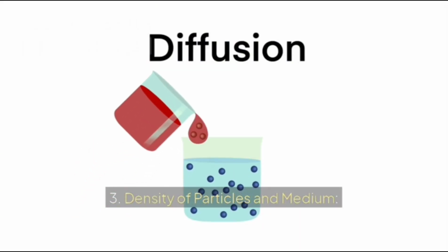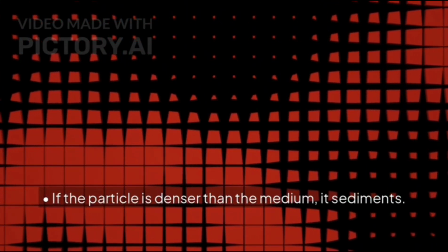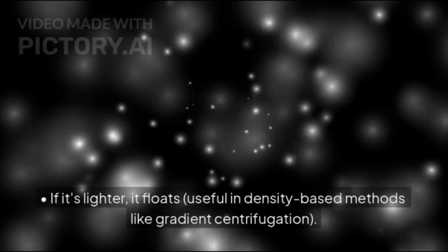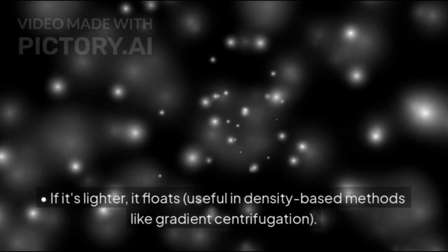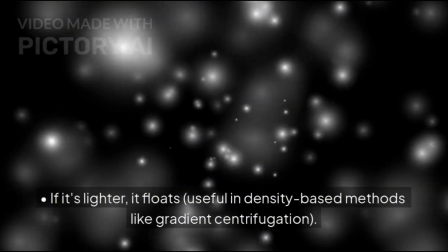Density of particles and medium. If the particle is denser than the medium, it sediments. If it's lighter, it floats, useful in density-based methods like gradient centrifugation.